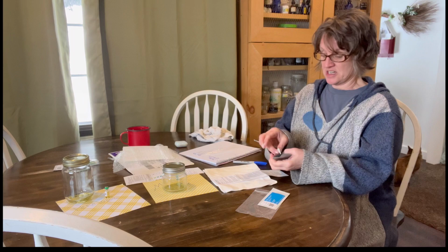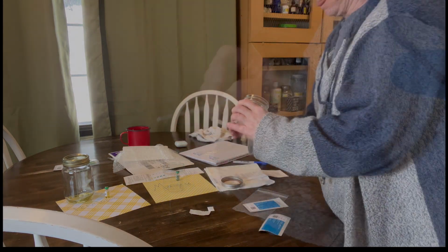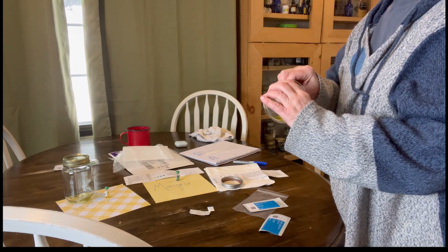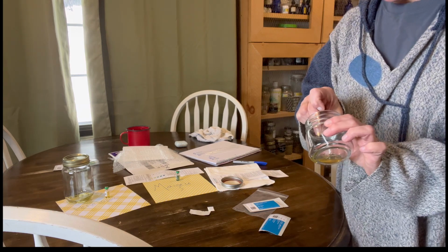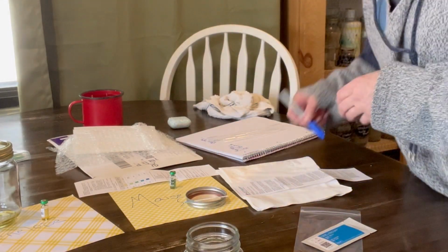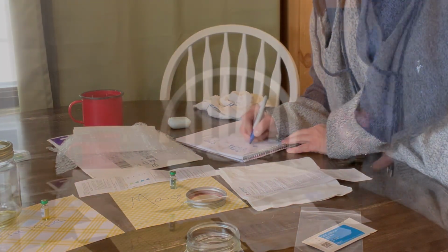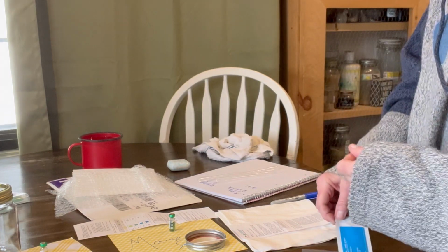Okay, these are very tiny and thin. You can see it's just very, very small. Dip this in Macy's. 1, 2, 3, 4, and pull it out at 5 horizontally. And kind of hold it and place it like that. And the time is 10:21. No, 12:21. And then I'm going to do Penelope's.